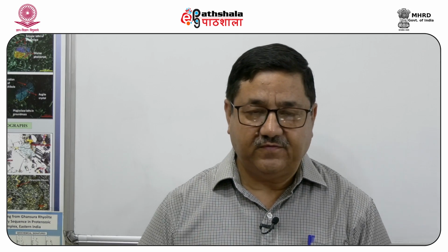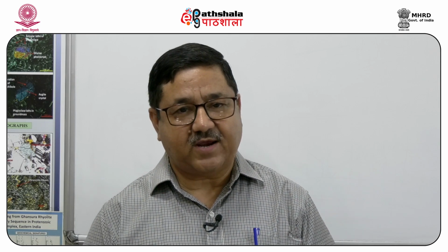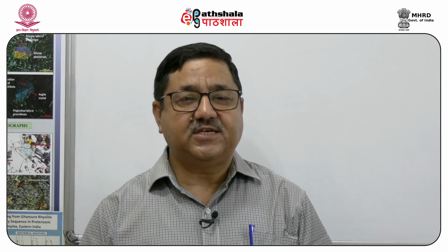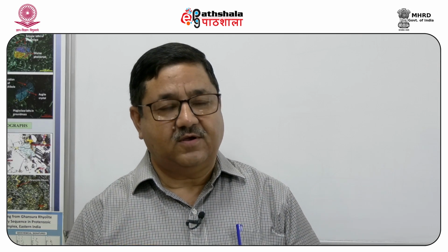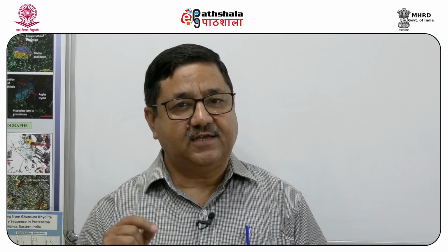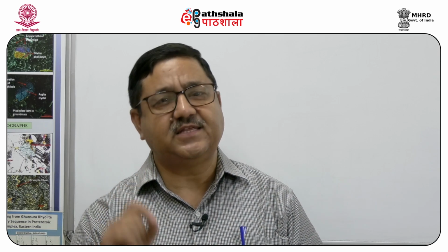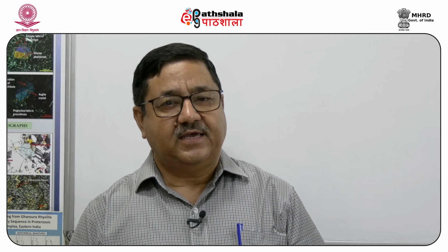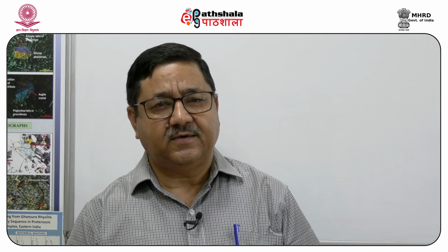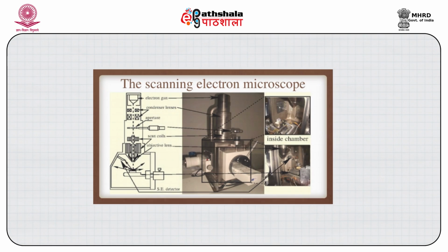Actually, the precursor of scanning electron microscope was a transmission electron microscope, which means that initially people and physicists experimented with a thin sample. By thin sample I mean that the beam of electron can pass through that sample, which means a very thin sample. Then in 1938 von Ardenne added a scanning coil to this transmission electron microscope, and that can be considered as the original or the first scanning electron microscope.